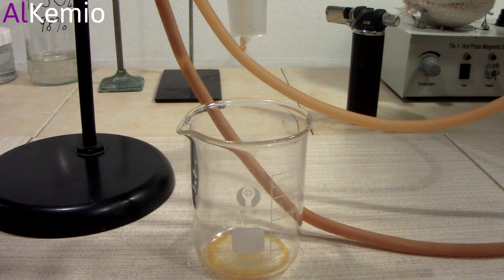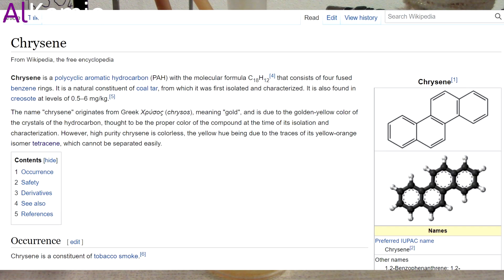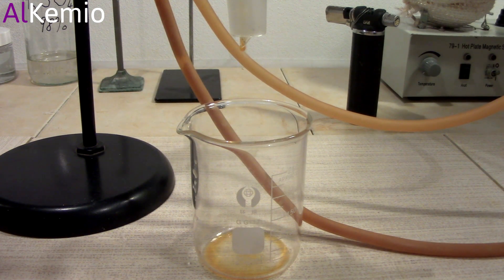The orange impurity you can see in it is probably tetracene with some chrysene. We will get rid of them later.